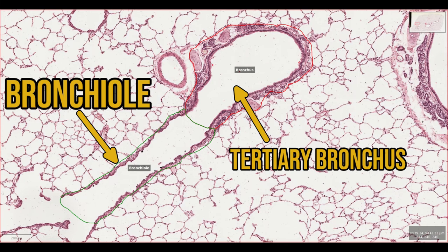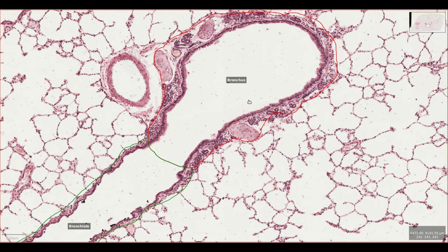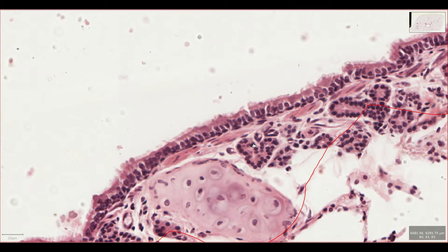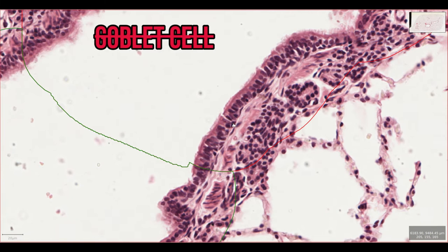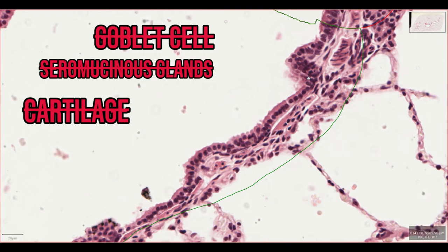The tertiary bronchus is very similar to the larger bronchi, but the smooth muscle layer is more continuous. There are fewer seromucinous glands and the islands of cartilage are smaller and more irregularly spaced. As we follow the bronchus down you'll notice a change in structure. The epithelium loses its goblet cells, there are no seromucinous glands and no cartilage — these three features make this structure a bronchiole.